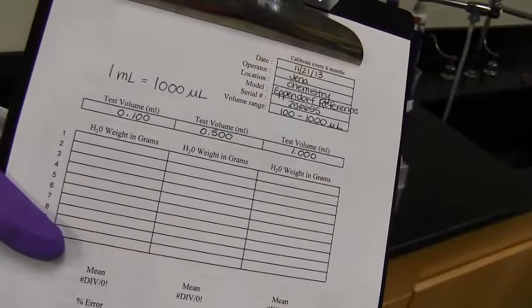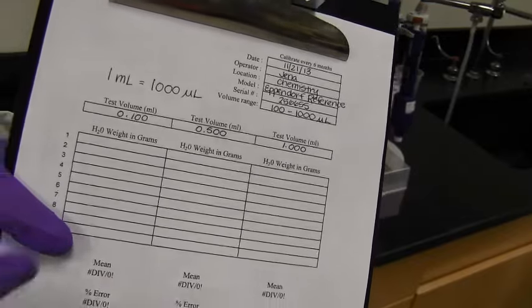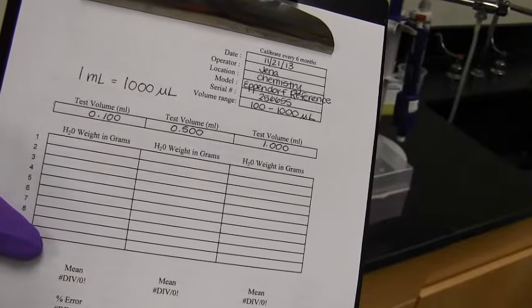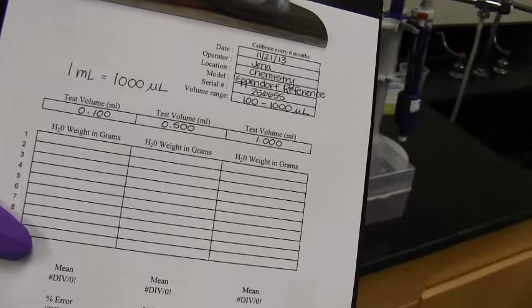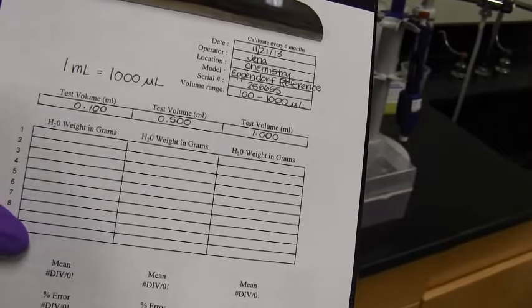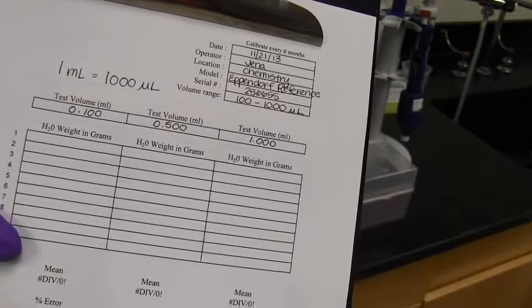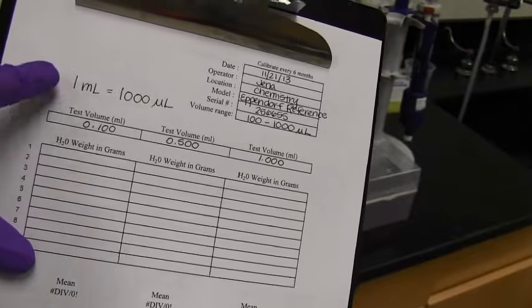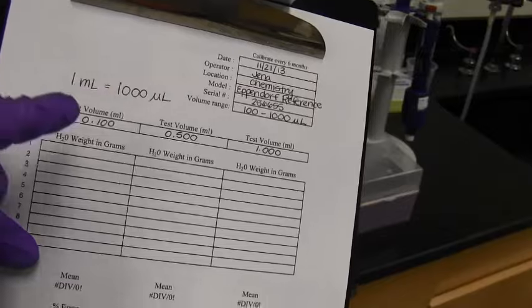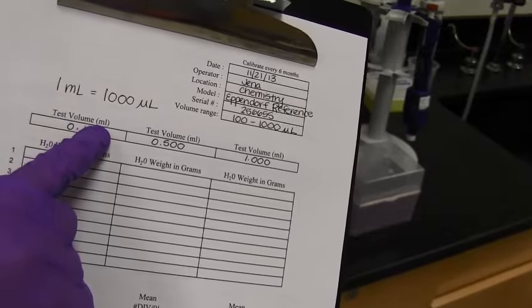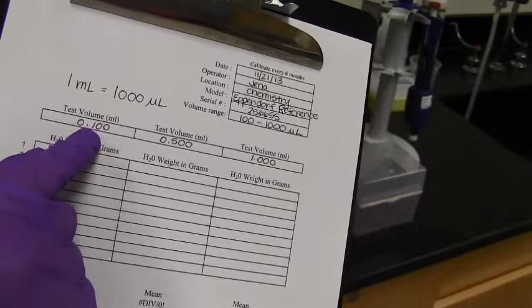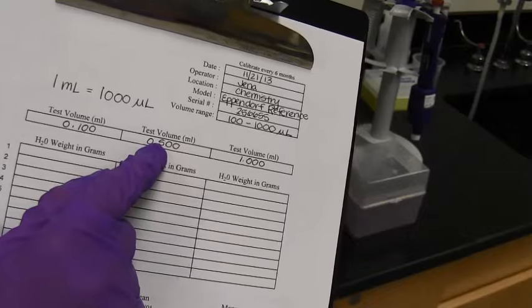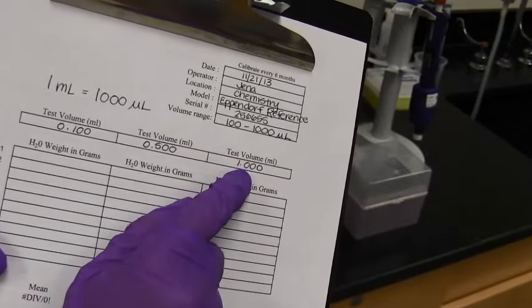Before we start actually taking some measurements, we're going to fill out our form first. Basic things that you'll need is the date, who's doing the calibration, what location the pipetter came from, the model number, which is located on the pipetter. For example, we're doing the Eppendorf reference. The serial number, which is on the top right near the knob where you change the volume. The volume range of the pipette, which is also on the knob. This one is 100 to 1000 microliters. I also put a conversion up here. So we know one mil is 1000 microliters. For this particular form, the test volume needs to be a milliliter. So I already went ahead and converted it. So the 100 microliters is going to be 0.1 milliliters and so forth. This one's going to be 0.5 milliliters. This one is 1 milliliter, which is 1000 microliters.